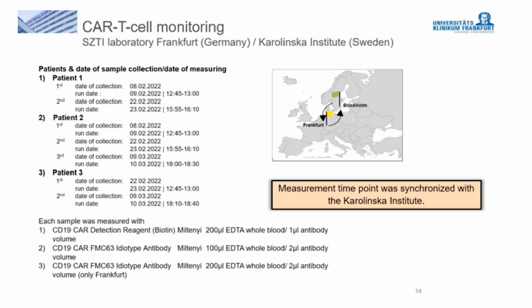Since no interlaboratory comparisons are officially offered for the analysis of CAR T cells, we performed comparative measurements with the Karolinska Institute in Stockholm. All patients from whom we received samples were treated with Yescarta, and in total we performed 7 comparative measurements of 3 patients. The original antibody from Miltenyi and the new FMC63 antibody were used.